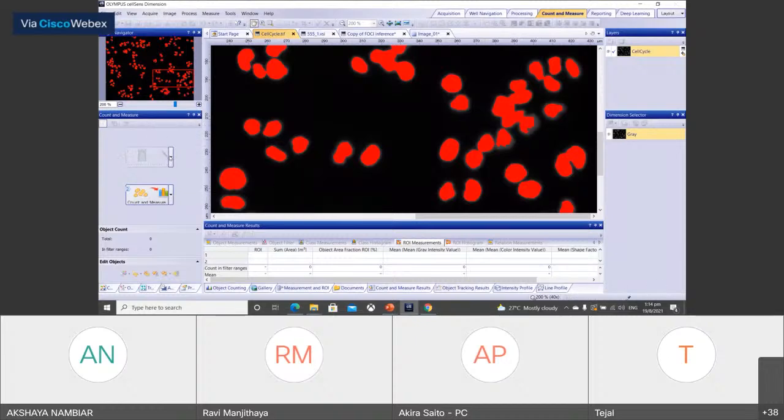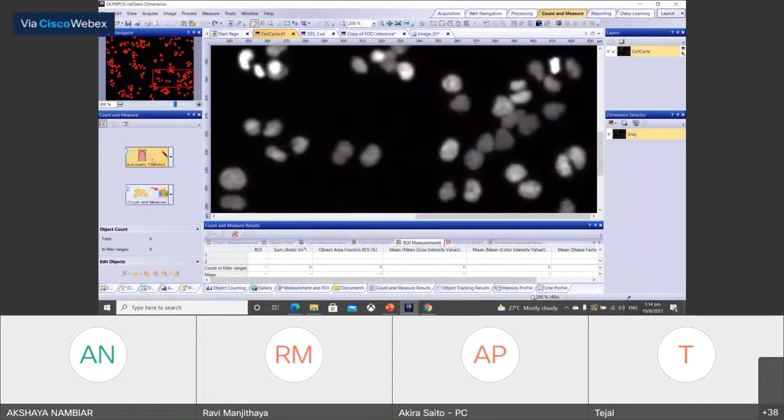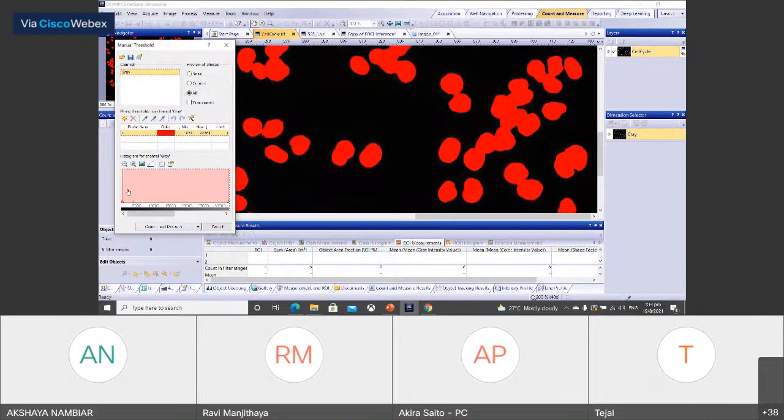So I'll just come back to the manual thresholding and give some kind of threshold over here.